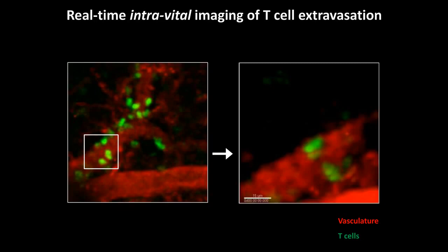And so in conclusion, I hope that I gave you a good overview showing how 2-photon microscopy allows for time-lapse imaging in vivo as a way to study the behavior of immune cells in various tissues, in order to characterize both their overall behavior and how different interventions could alter this behavior.